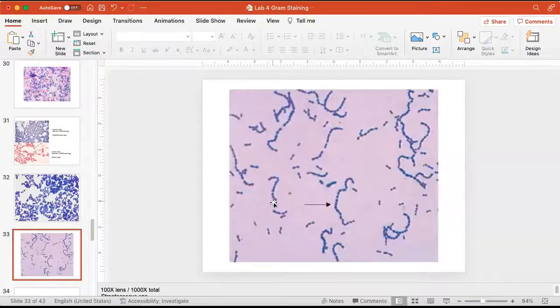This is a gram-positive coccus. Don't forget to tell me what cell shape you see. This is a gram-positive coccus. And this coccus is forming some very nice chains. See the chaining? Look at these chains. This organism is living in little communities of cells.